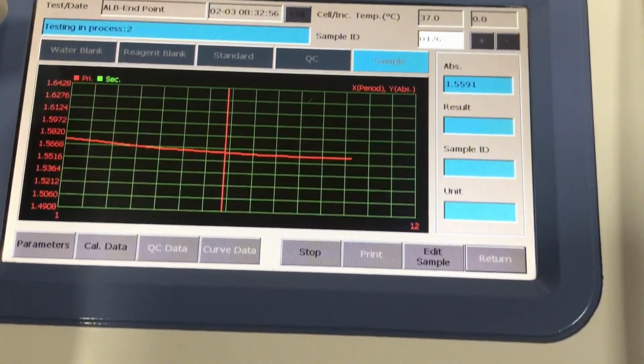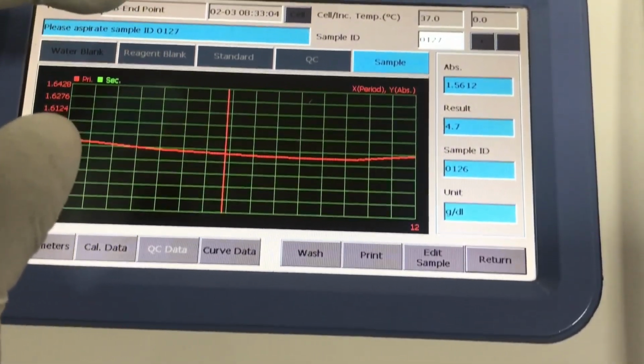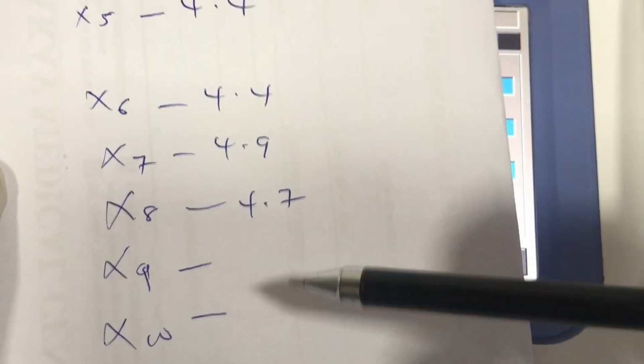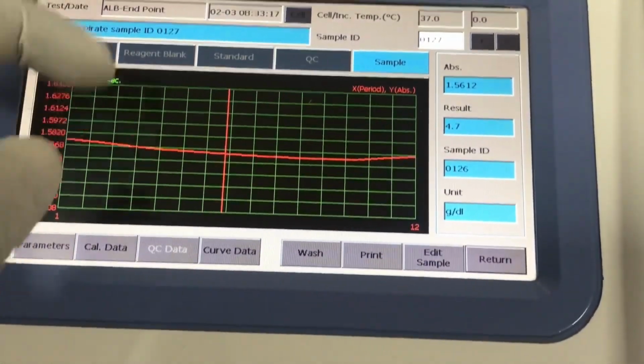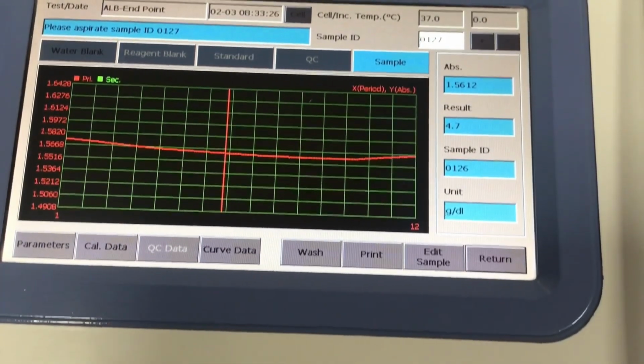Okay, so we are doing number 8, and that gives us 4.7. So we're beginning right from number 7. We're going to have a slightly higher value again, and then it's coming down again. So let's do number 10, and then I'm going to fast track this video to the 20th measurement, and then we use that to calculate the standard deviation and then the mean.